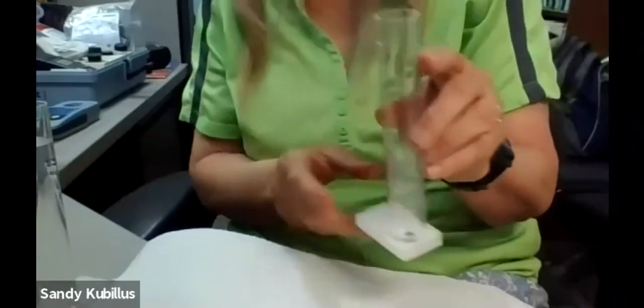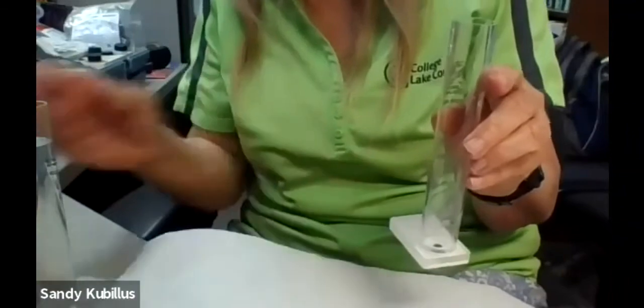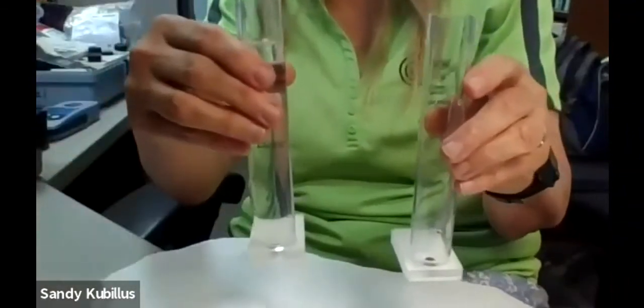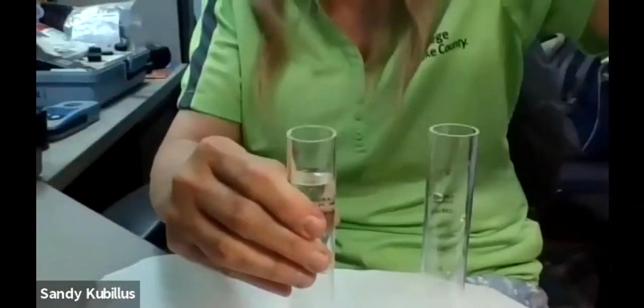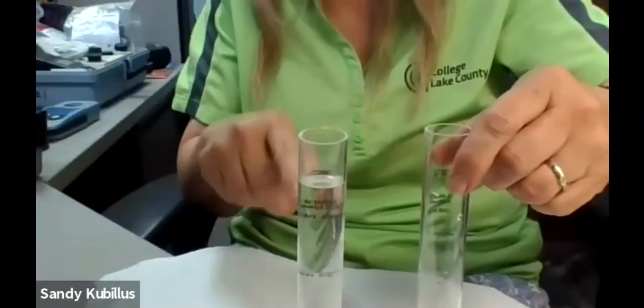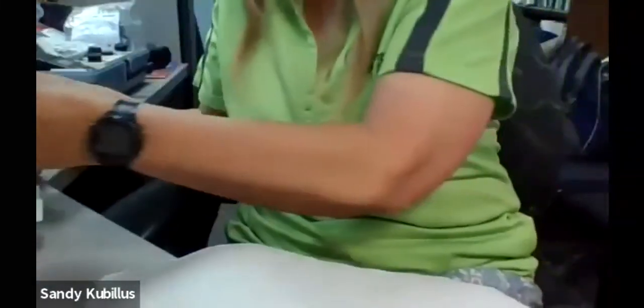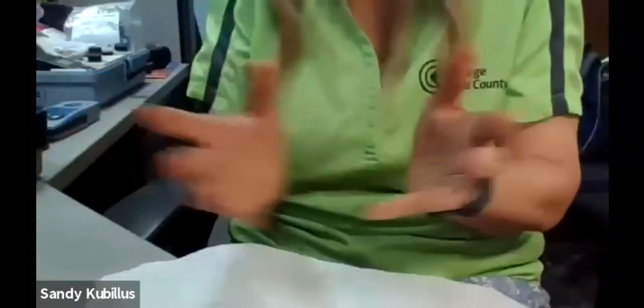So you'd fill this up with clear water, like tap water, and then you have your sample in another one, and you look down from above and add this solution that would make the clear water match the turbidity on here as you look at that black dot on the bottom. It's a little bit of a crude method, but it does work. It's not as fancy as a meter, but at least it does work a bit.